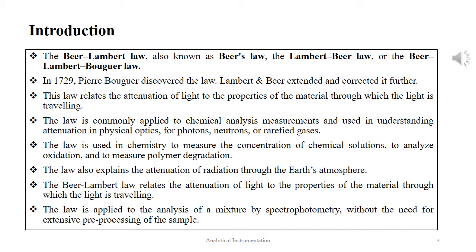The Beer-Lambert law relates the attenuation of light to the properties of the material through which light is traveling. The law is applied to the analysis of a mixture by spectrophotometry without the need for extensive pre-processing of the sample.